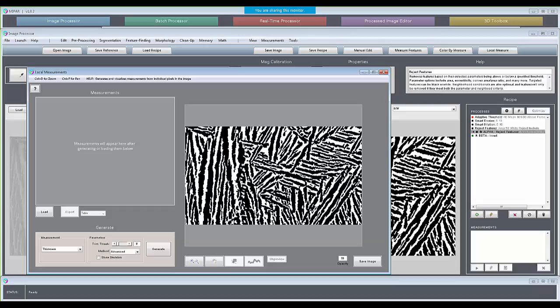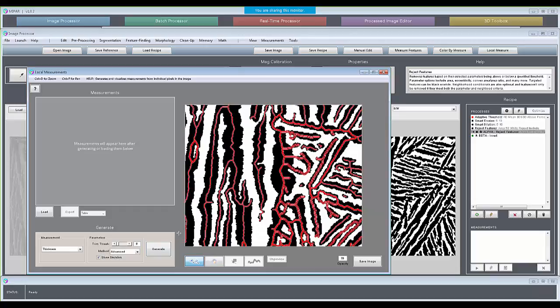Maria asked about unbiased sampling, like for stereology, so I will go back and address that after I show this local thickness tool. It's auto done the skeleton here. If you check it, you can see what it's done. The advanced method usually adds fewer branches and spurs than the classic, but sometimes you still do need to add a trim threshold to get rid of branches like this.